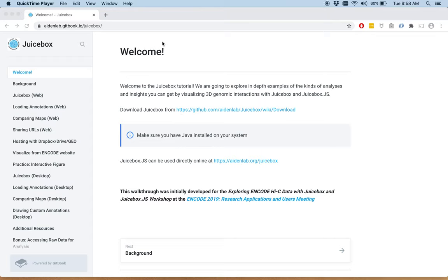Hello and welcome to the JuiceBox tutorial. We are going to explore in-depth examples of the kinds of analyses and insights you can get by visualizing 3D genomic interactions with JuiceBox.